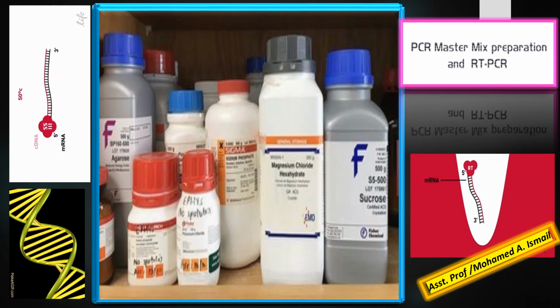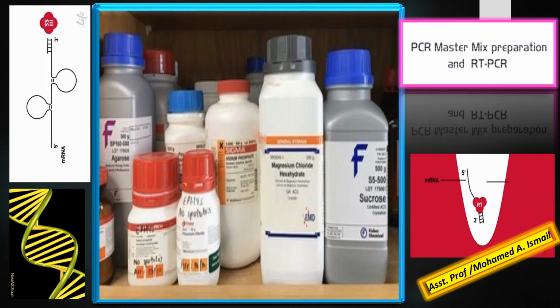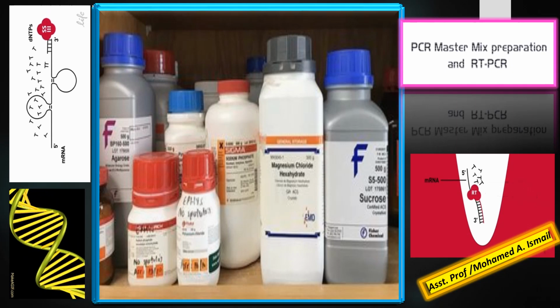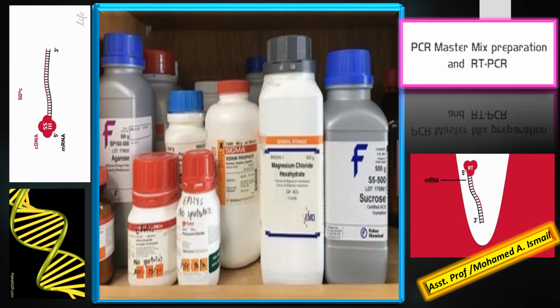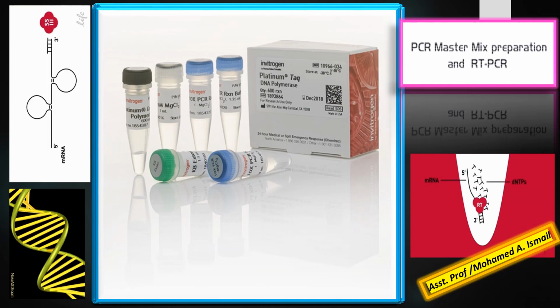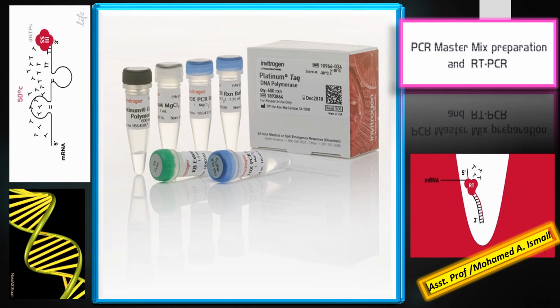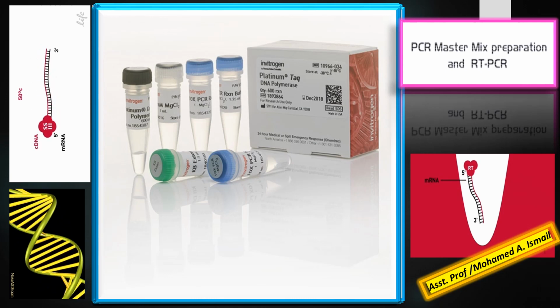When you use them, all reagents should be allowed to thaw on ice, except the enzymes reverse transcriptase and Taq polymerase, which should be kept at -20 Celsius until used to avoid degradation.